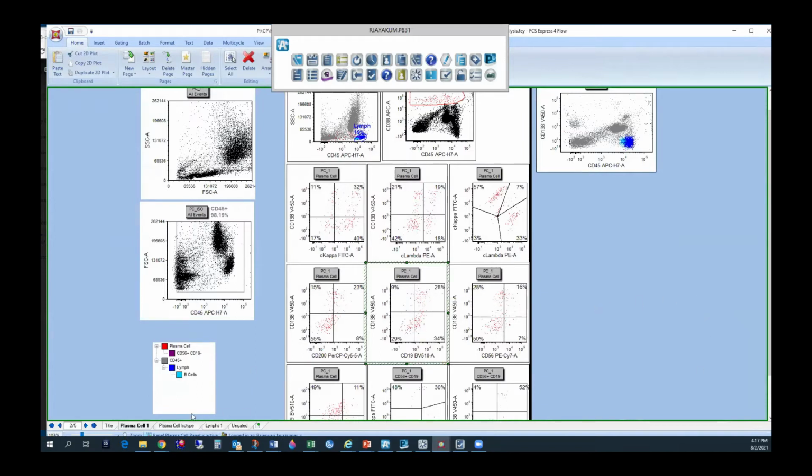Yeah, so like this, when we validate our panel or when we do our QC every day, wherever your beads show positivity, that's where you decide. Okay. And to my understanding, I think it's more like a control population. Right, exactly. You do the patient specimens. Right. Got you. Could I also add a perspective?